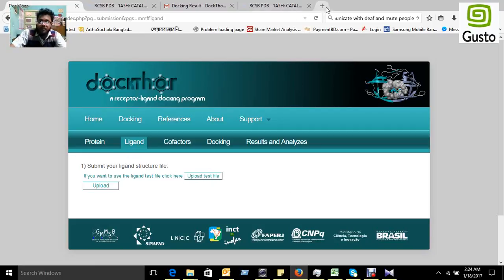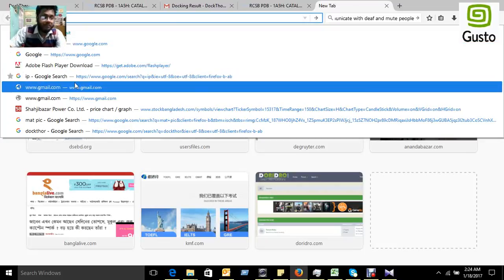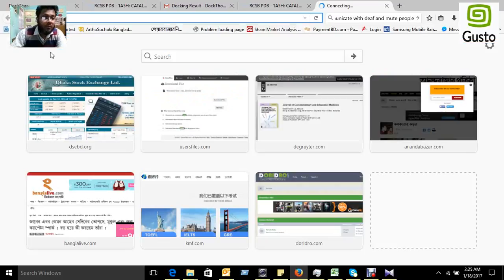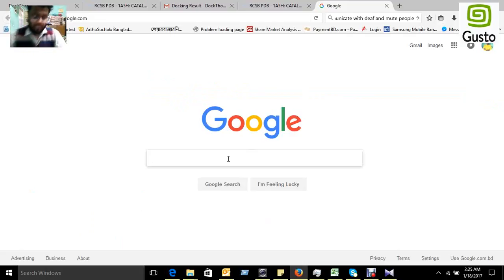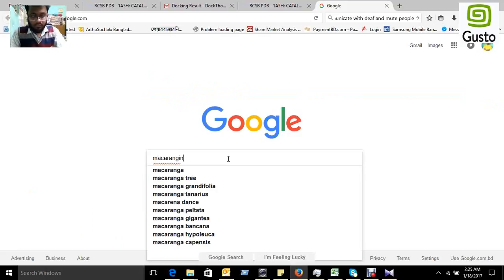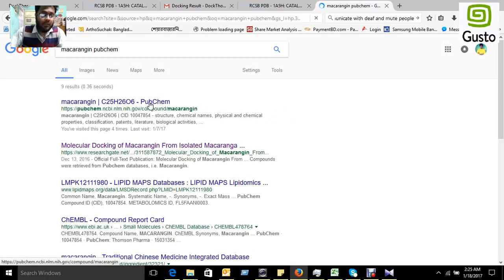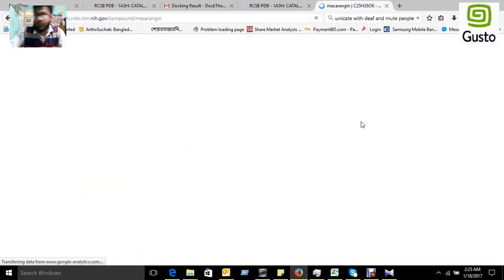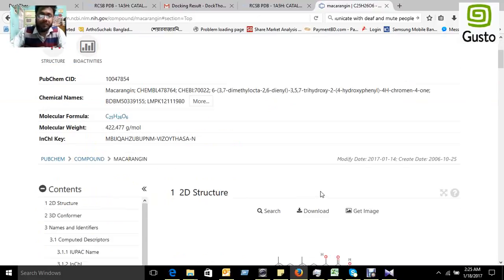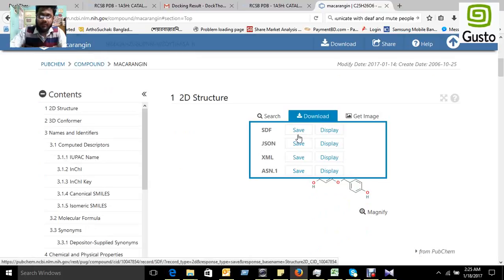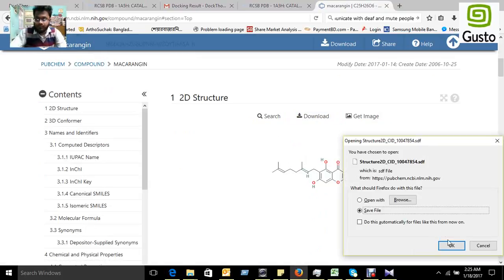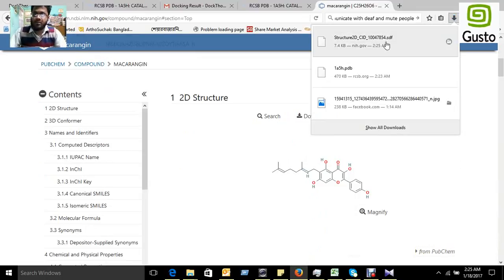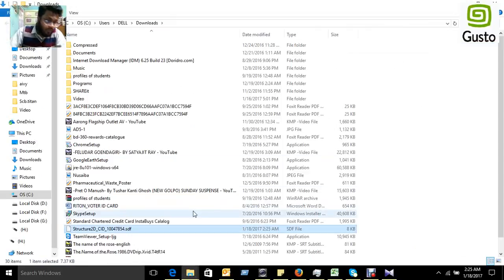So again we have to go to Google and search the ligand. The compound is named macarangin. In PubChem, here is our compound macarangin. We can download this compound from PubChem database. PubChem is the biggest site for any chemical structure. Here you can download the SDF file. The structure is downloaded, just figure out where it was downloaded.